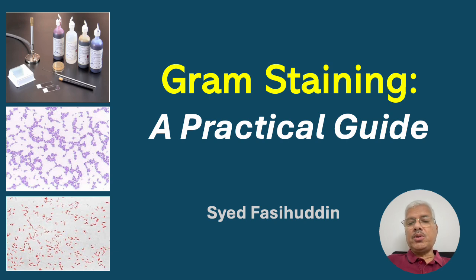Gram staining helps to classify bacteria based on their cell wall structure, which is a fundamental characteristic used in bacterial taxonomy. The gram stain can provide insights into the physiology of bacteria.